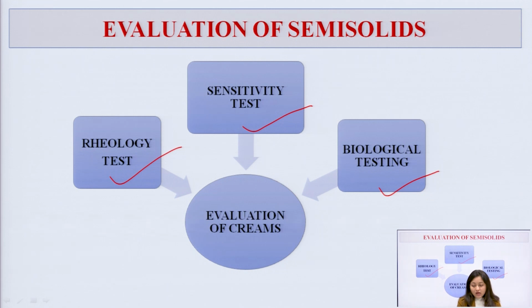The rheology test is performed in order to assess and evaluate the viscosity of our formulation. If the rheology properties of any semi-solid dosage form do not comply with the standard, then there are issues.